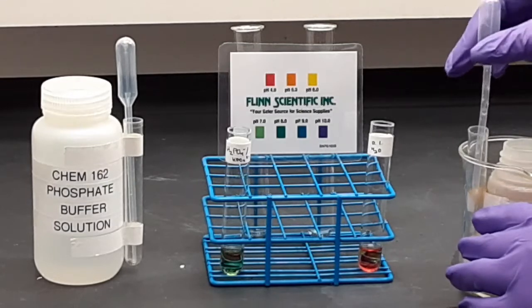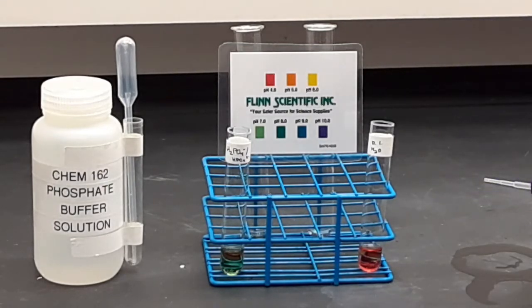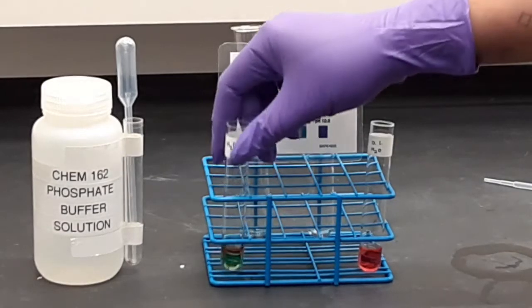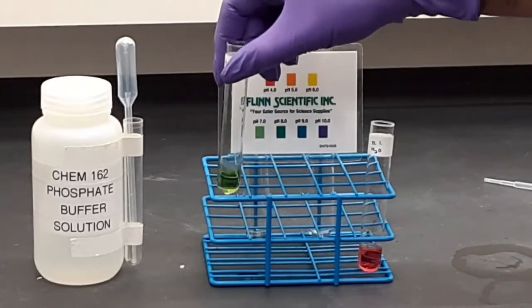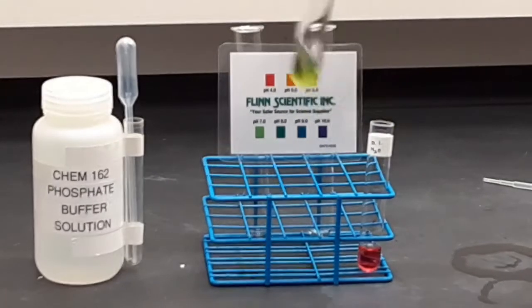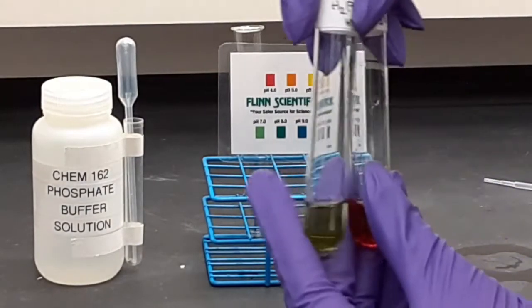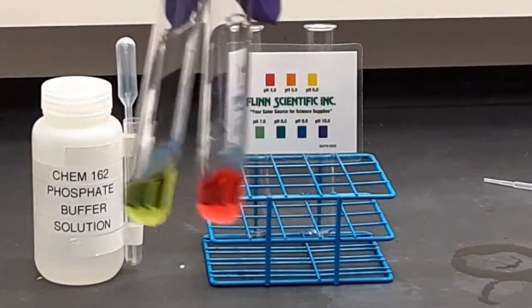One drop in each tube. Now Heather's going to give each tube a little bit of a shake. The tube of buffer did change, but not nearly as much as the tube of water. So clearly the buffer resisted the change.